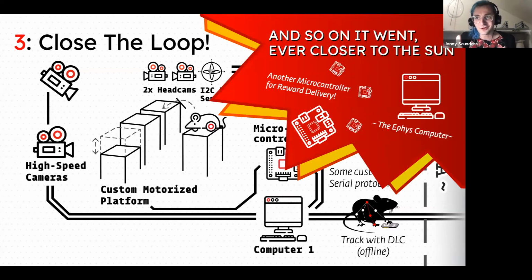And I'm going to skip a lot of the details here. And so on it goes, where we also want to gather electrophysiological data. We also want to control another set of solenoids to deliver rewards, etc. So the complexity only compounds when we get into the full experiment.